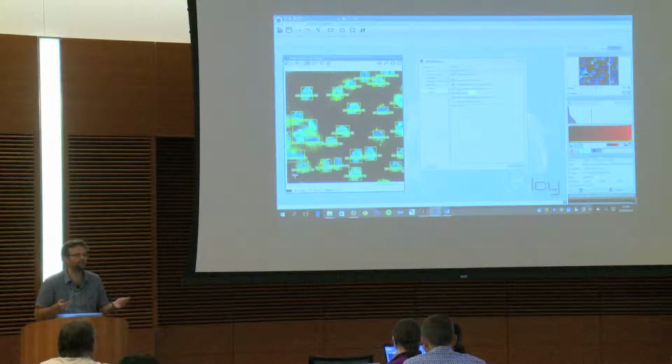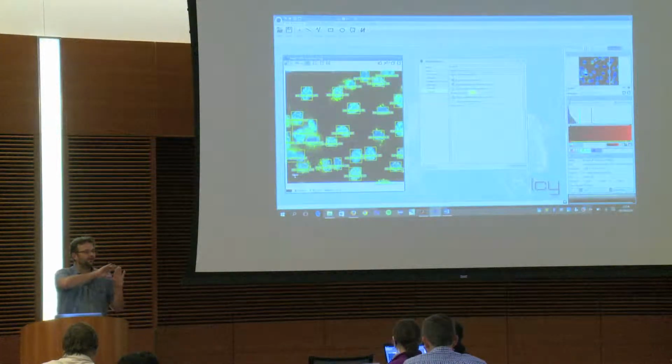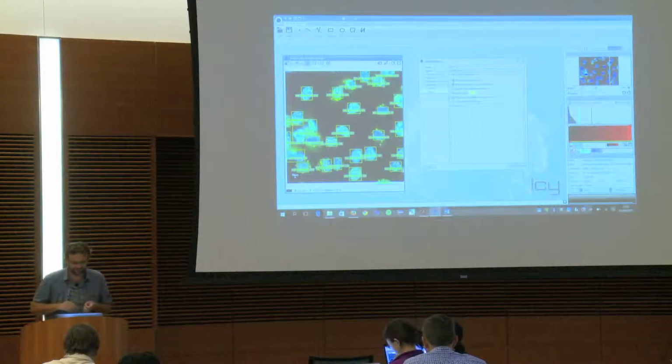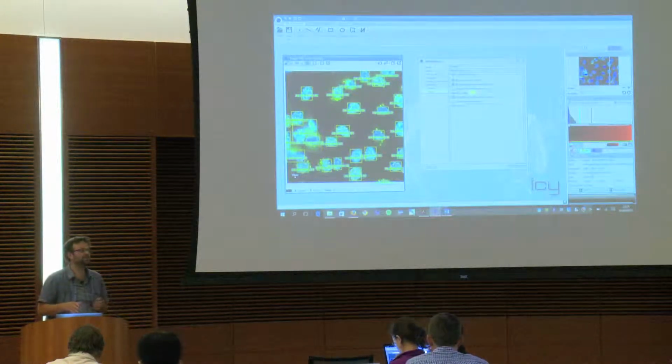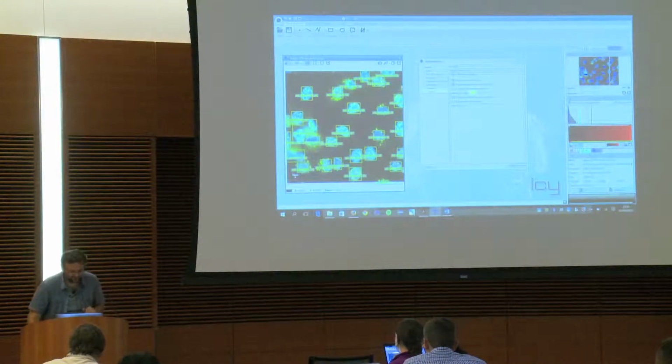So if somebody tells me, your plugin is cool, but you didn't foresee that I will need to change the sensitivity over time in my T sequence, because this detector works in 4 dimensions. So this guy is going to tell me, I want you to make your GUI more complicated so that now I can put a formula or I can have a tick box, because I want to do my very, very specific thing. So for this guy, I will tell him, okay, it is too specific.